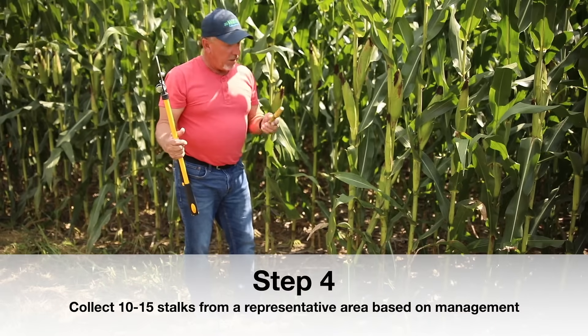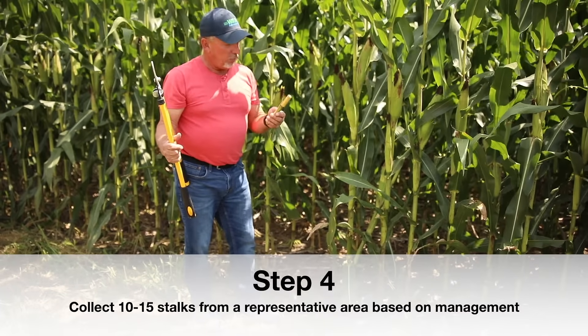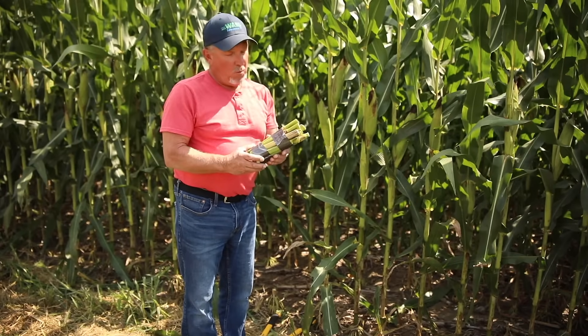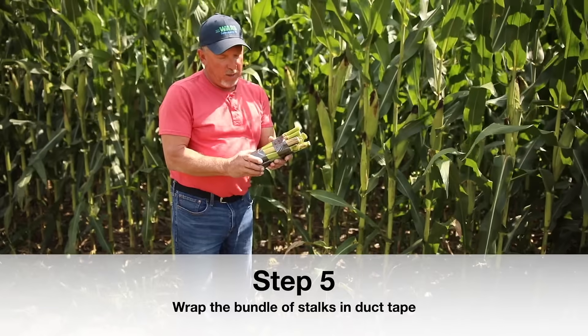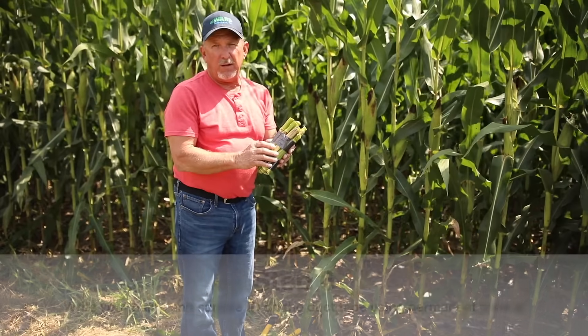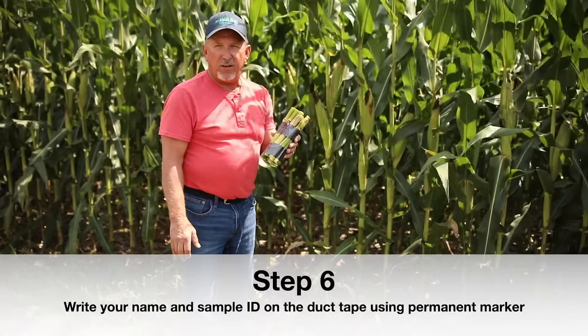Now I'll go in and collect a random sample across the field, and then we'll get things ready for the lab. We're back from collecting our random samples across the field. What we've done is taken and bundled them together and wrapped it up with duct tape. On the duct tape I wrote the name and the sample ID, and then we want the stalk nitrate test.